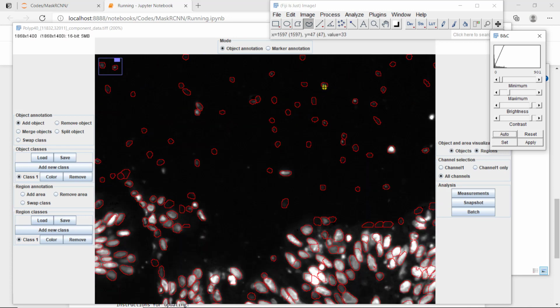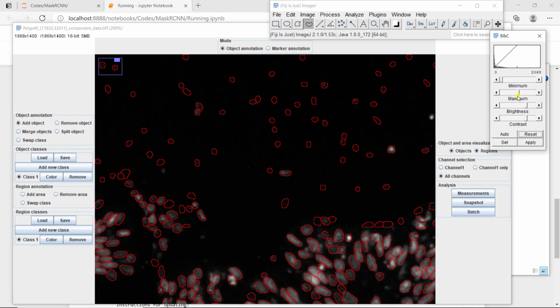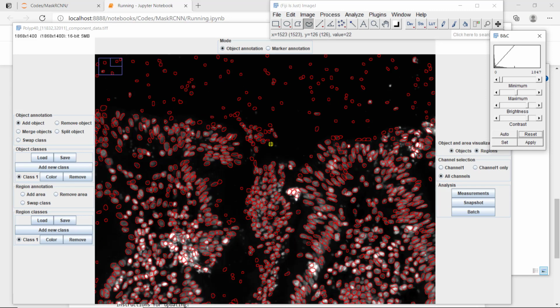This maybe, but it's really faint. If I go back, it's really faint. But clearly these ones probably are real, but these ones aren't. That's what we call hallucinations in deep learning. And by combining with UNet, we'll get rid of them. So don't worry about that.